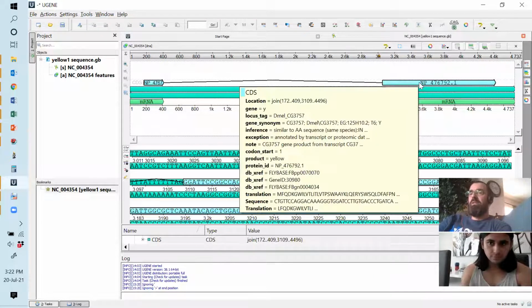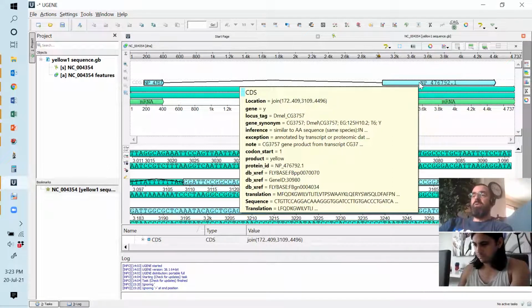It's hard to show online because I can't move my cursor. Where I'm pointing at my screen, the first bit of information where it says location, the bit in parentheses after that, those are the bases of the beginning, start and end of exon 1 and 2. Sorry for the confusion earlier. I was looking at the mRNA, which has the 5' and 3' UTR.